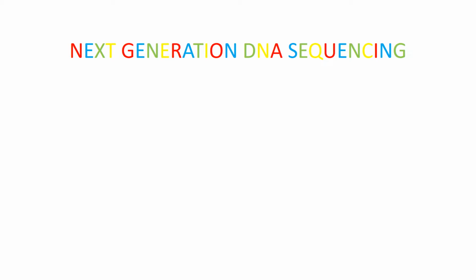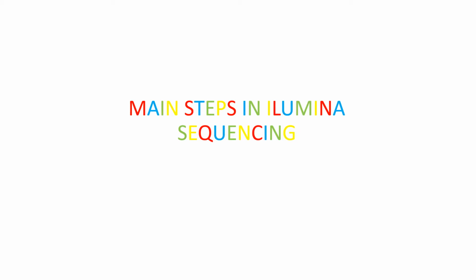As a continuation from Quiva, I am now going to discuss next-generation DNA sequencing. An example of next-generation DNA sequencing is Illumina sequencing. I will explain the main steps in how Illumina sequencing works.